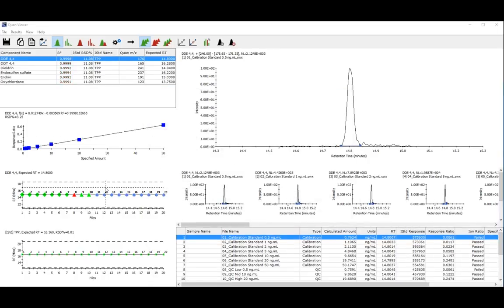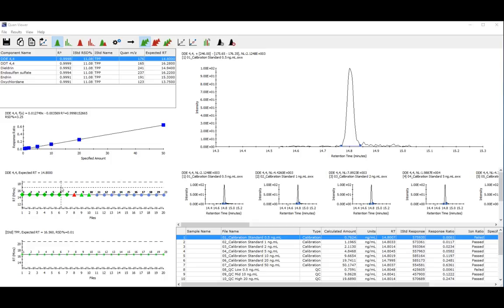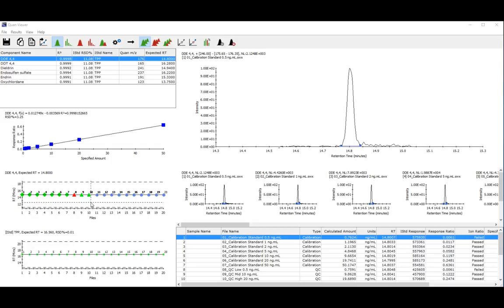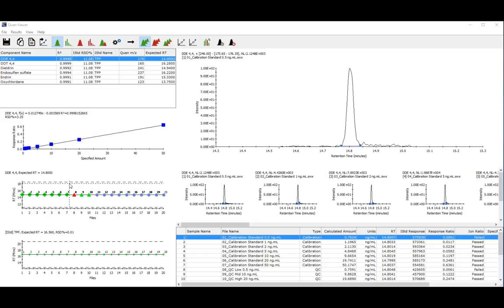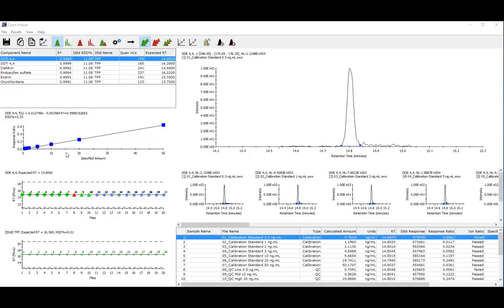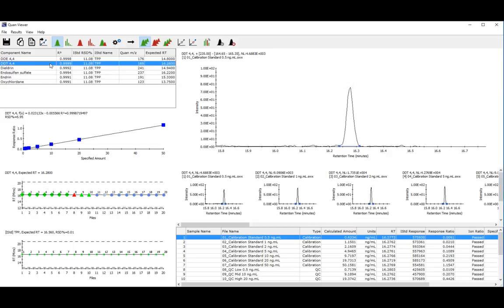This plot shows the status of the component DDE for each of the sample types. The green diamonds represent found calibration components. The green triangles represent found and past QC components. The red triangle represents a found but failed QC component, and the blue dots represent found components in the unknowns. A component not found in an unknown would be represented by a grey dot.